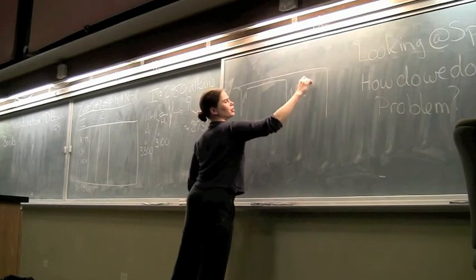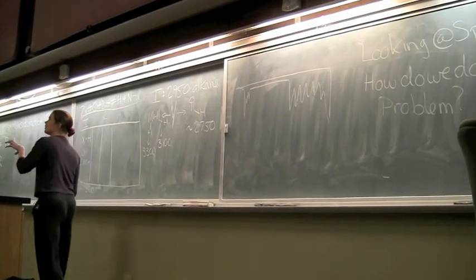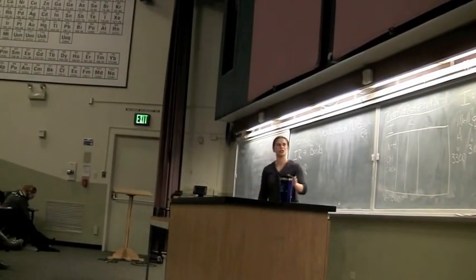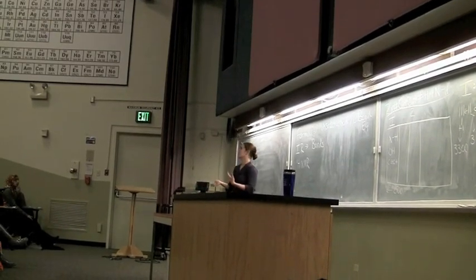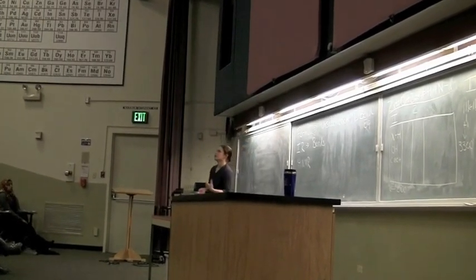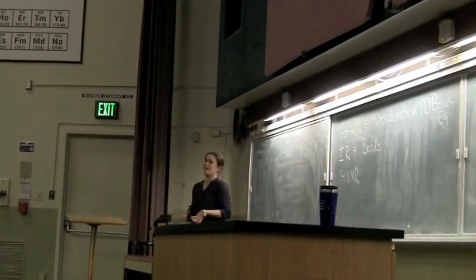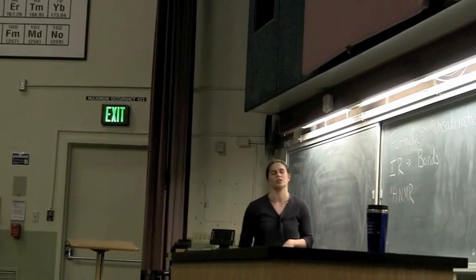and then later on we're going to find our fingerprint region. And that's a good reference point. Say, where's my fingerprint region, where's that alkane? Because it's in pretty much every molecule. So we're looking just to the left of it or just to the right of it, we're looking at certain types of groups, even if you don't remember exactly what the number is. Because almost all organic molecules have alkanes in them. I mean, there's exceptions, but most everything's got some CHs in there.